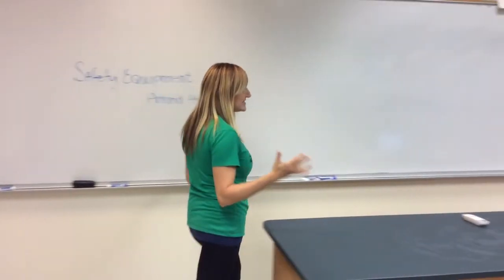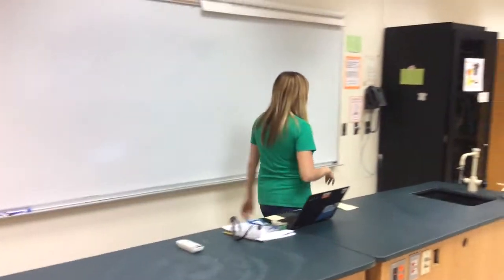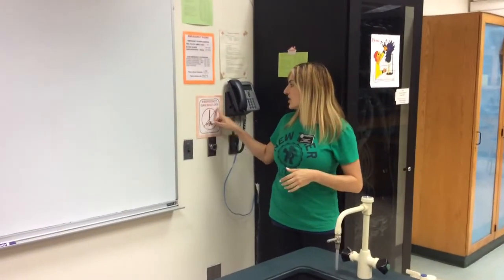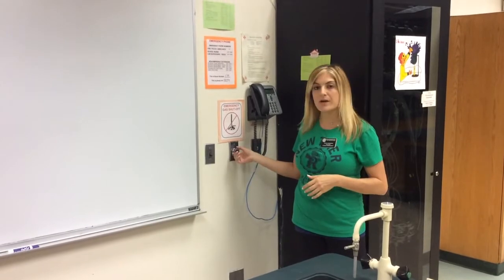In the event of an emergency, or you need to turn everybody's gas off, if there's a fire, if your station's on fire, if the fire alarm goes off, the emergency gas shut off switch is right here. It's this red button.